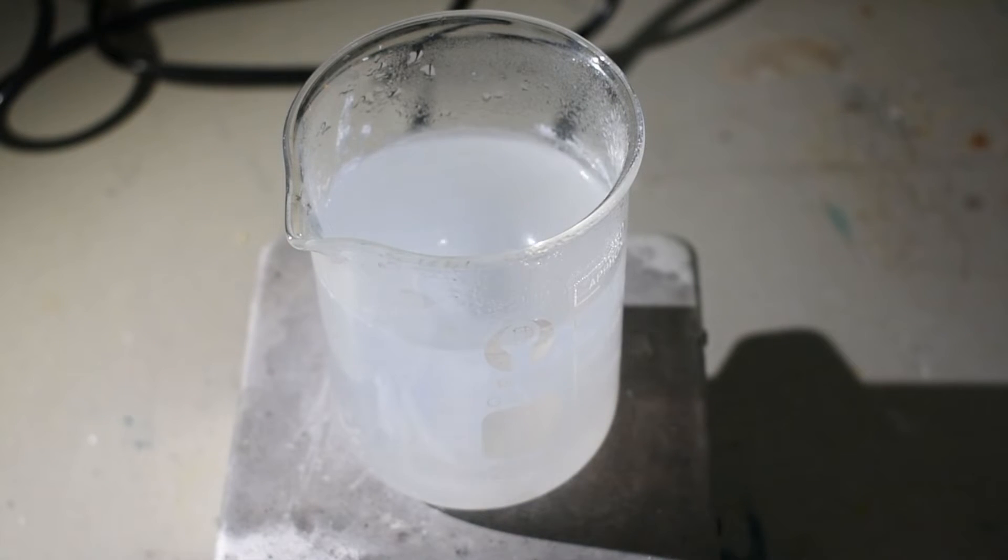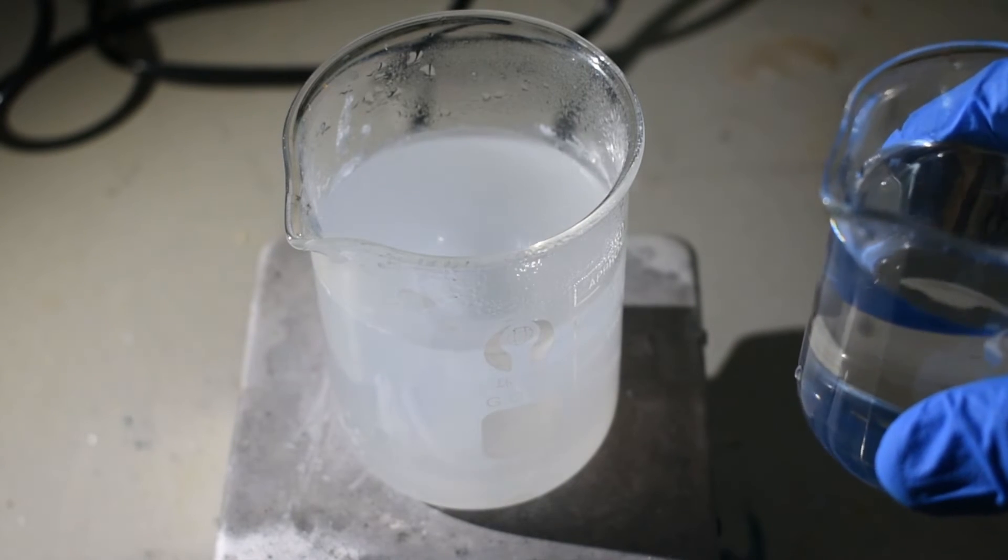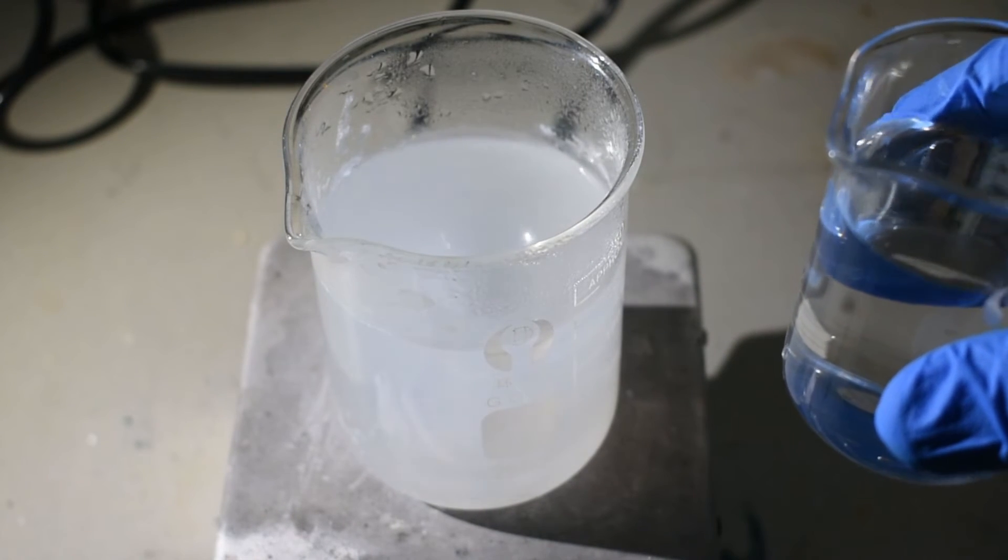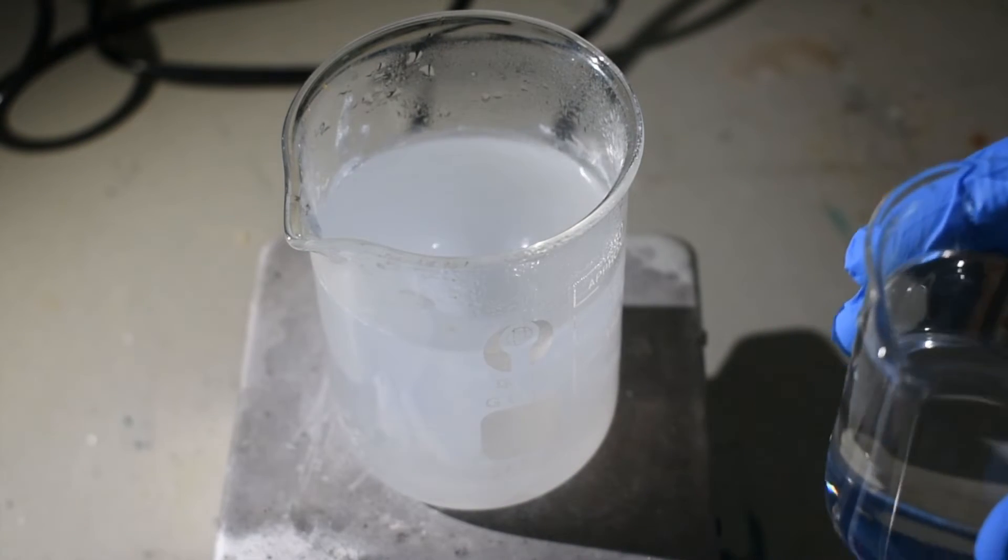But I'm just going to use this as is while it's hot, just in the interest of time. So, I'm going to add the 35% hydrogen peroxide very slowly until no more solid barium peroxide is seen upon addition of hydrogen peroxide.